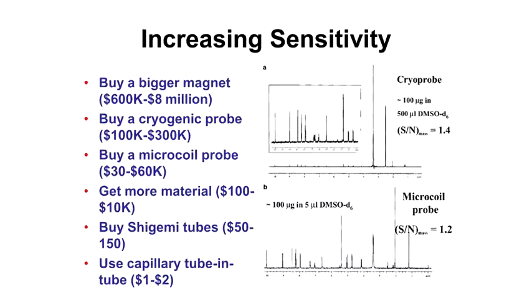A really, really cheap solution is to use tube-in-tube techniques. I'll talk about those a little later.